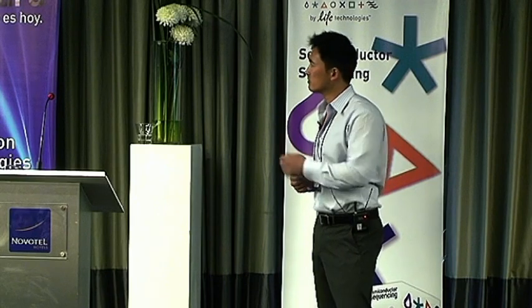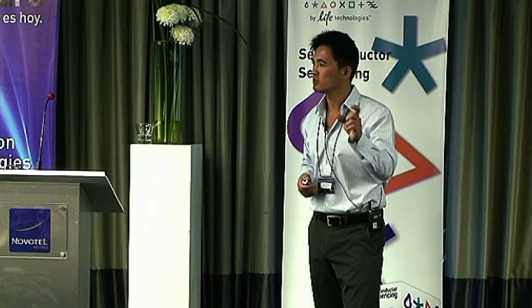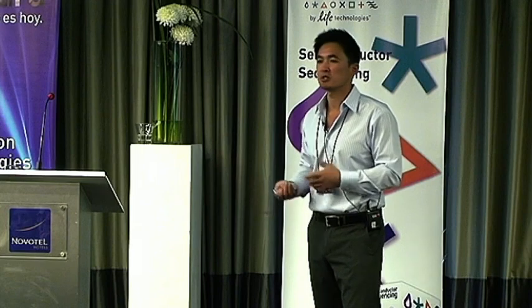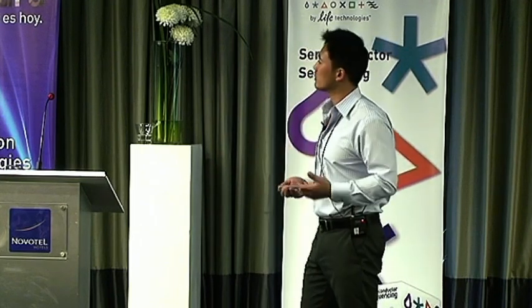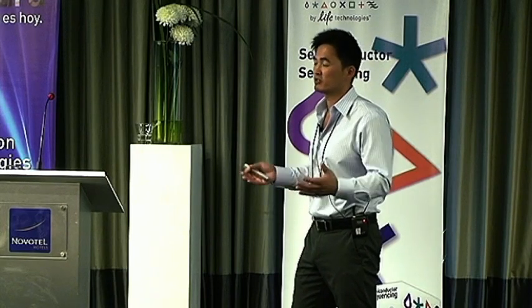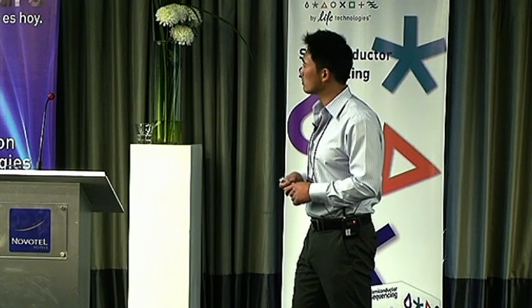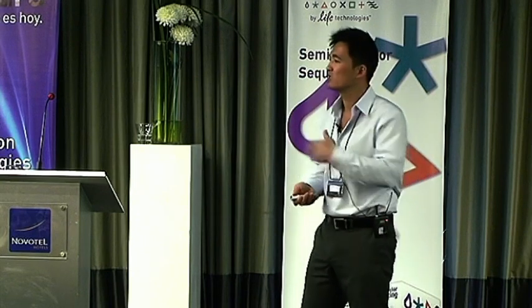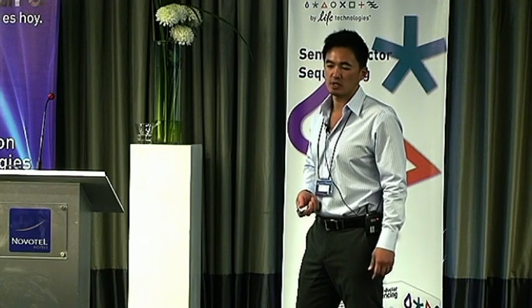And they were very successful in the early phases of the study using those microRNA panels that I showed you early in the talk. They found in some cases, like MIR16, an 80-fold increase in expression values for the population group that exhibited very high or full survival 5 years after surgery and chemotherapy. And there were a number of other miRs as well that showed 40-fold expression increases, 20-fold expression increases. So a very, very powerful and quick-to-use screening tool.